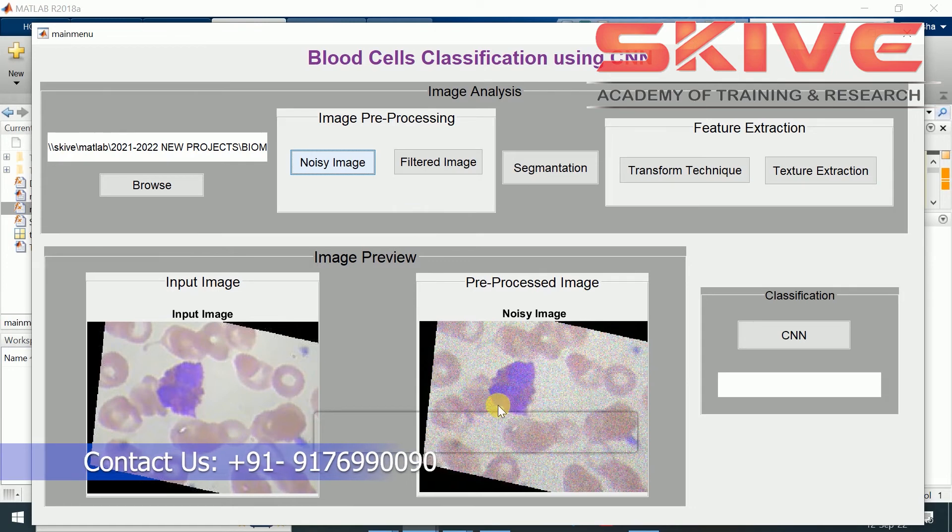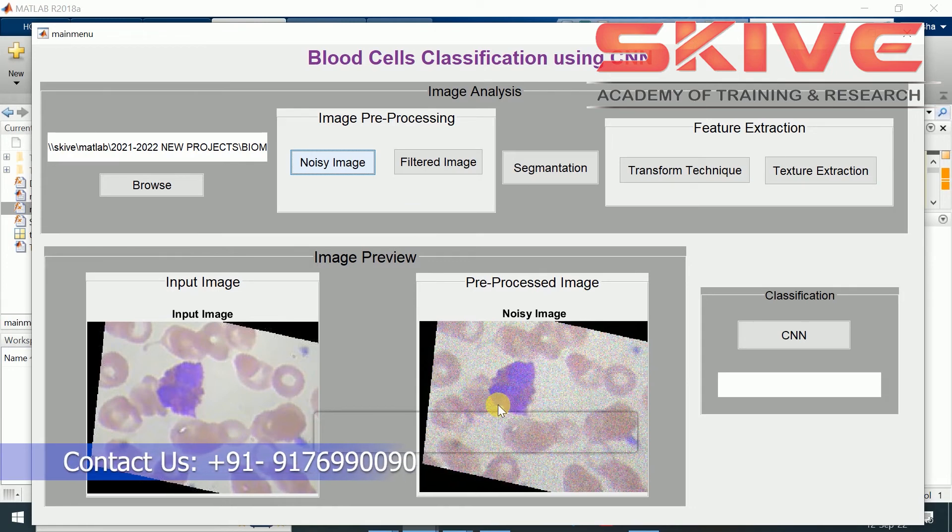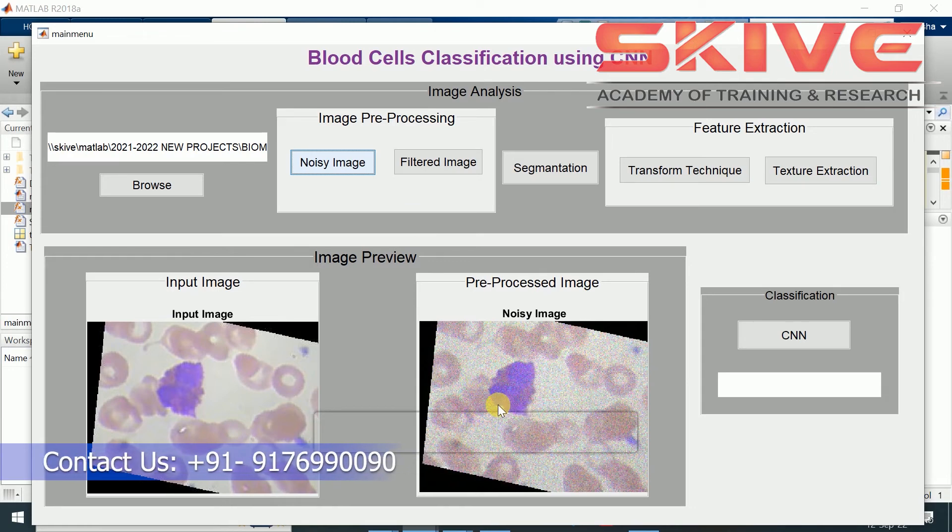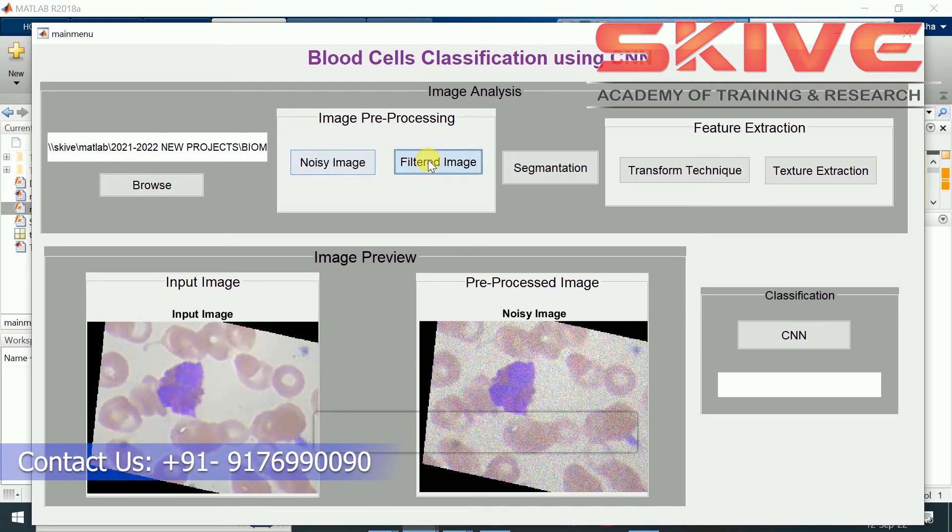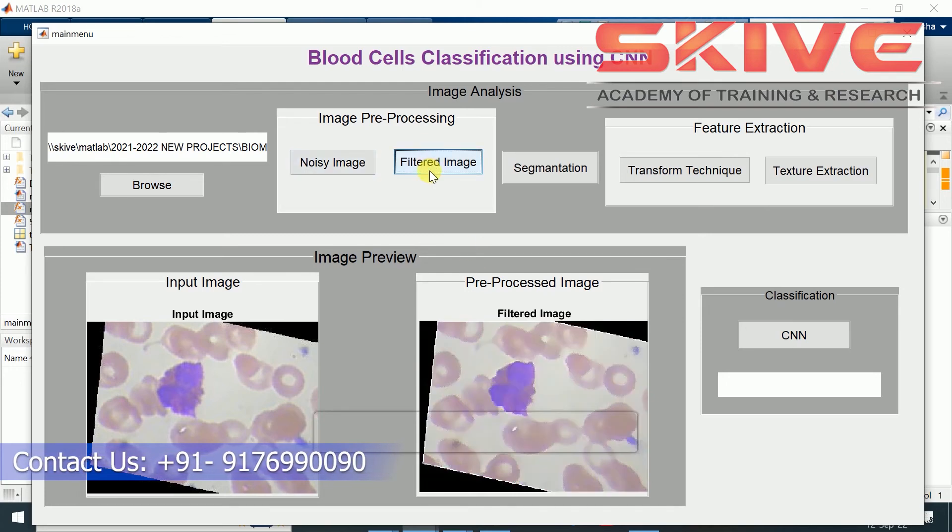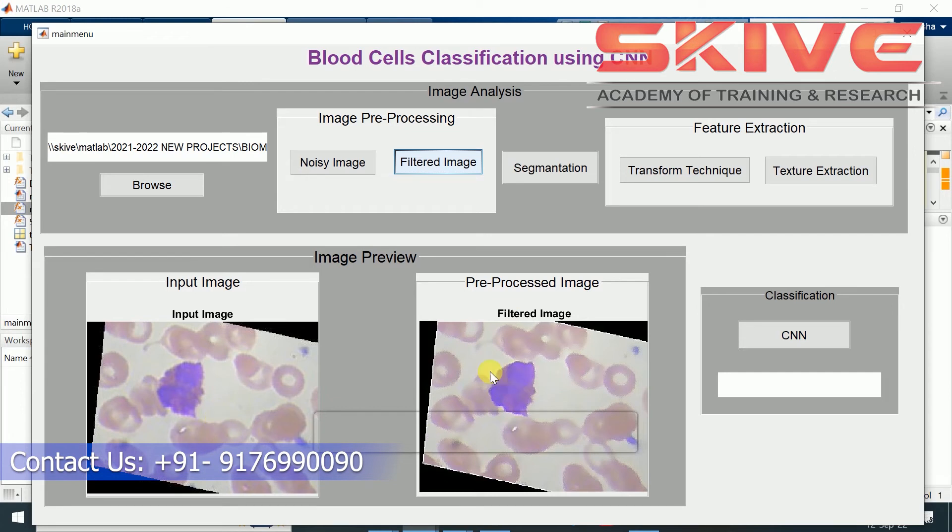This additional adding of noise will be thoroughly eliminated using the filtering process. For removing the minute noises present in the image, we are extra adding the noise to the image, then applying the filtering process for clearly filtering the image. We can see the difference.